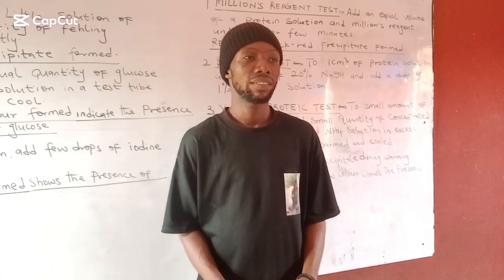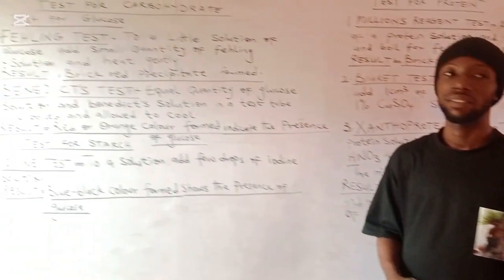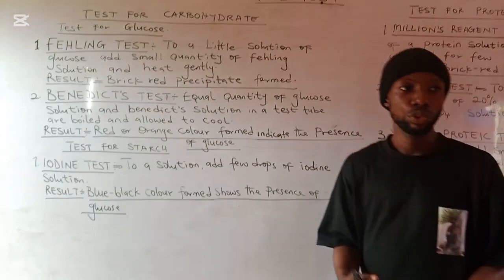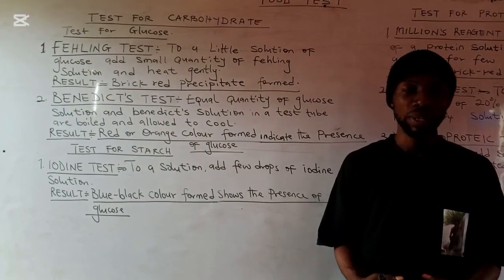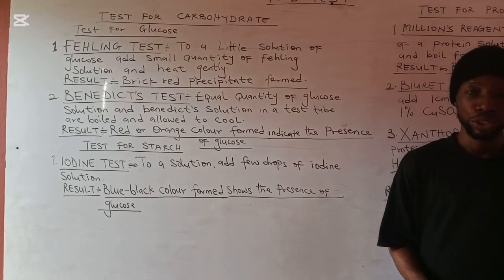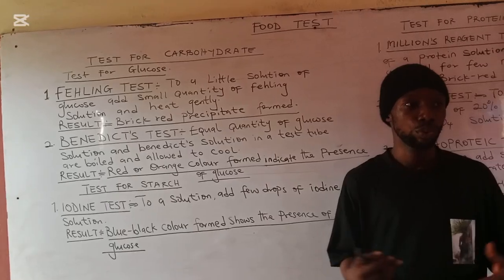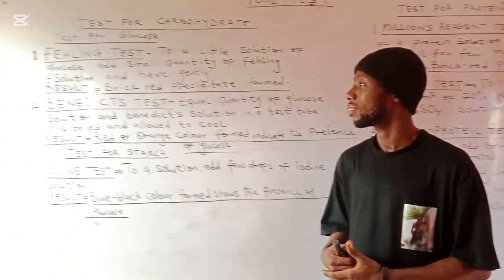Dear students, today we're going to look at food tests. Food is comprised of certain chemicals, so we can carry out some chemical reactions to show the presence of some of the food components.